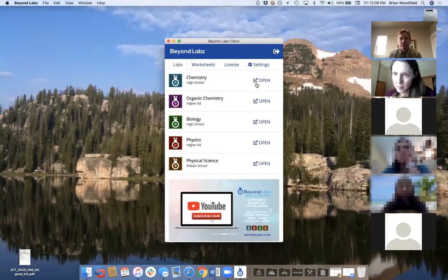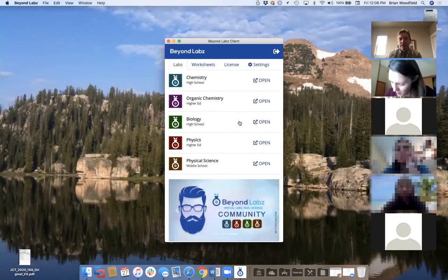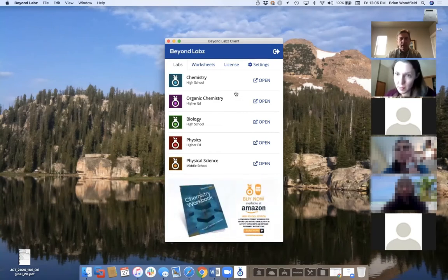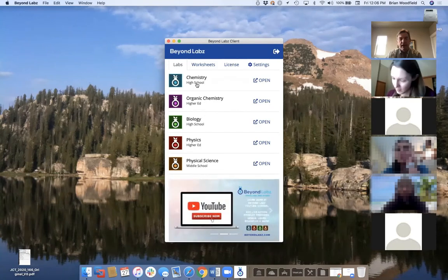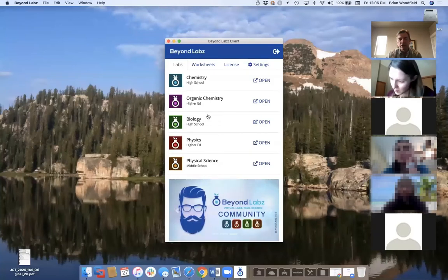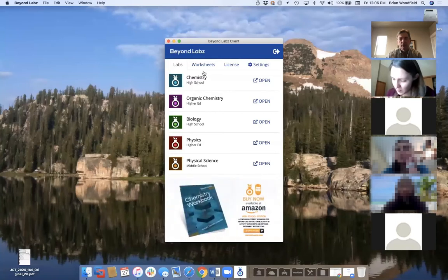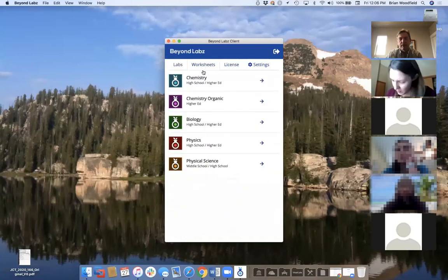Once you have your labs installed, you would see a download button and download the labs you want. Clicking open will open the lab you want. The client has high school and higher ed levels — that doesn't change the lab itself, it just changes which lab activities are available. Lab activities are available in a tab called Worksheets, divided into the different products.